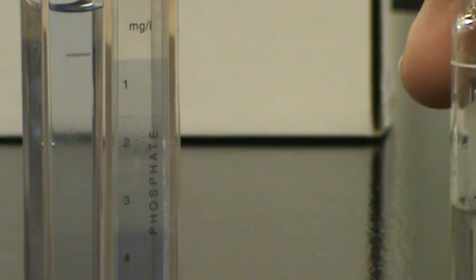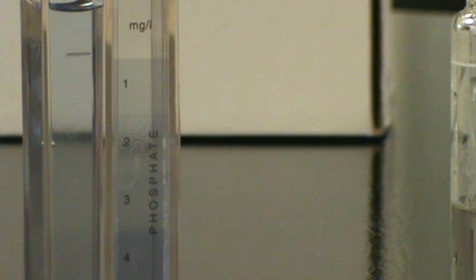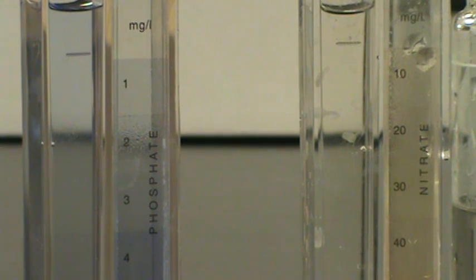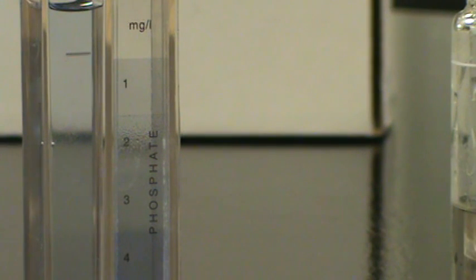And that concludes the first two experiments in our water quality. The phosphates, which we gave it at about a one, and our nitrates, which it's just starting to turn colors. I'm still going to call that less than a 10, 10 perhaps, maybe at the most, but it's still not unhealthy for people to drink. And it's also after the four minutes that you're supposed to take it. So probably as it sits here, the longer it sits, the more it's going to turn color. We've taken it at the right time. We got a reading of zero nitrates in the water. Therefore, that water is healthy to drink. It gets very low in phosphates, very low in nitrates. When we come back, we're going to do the hardness test.